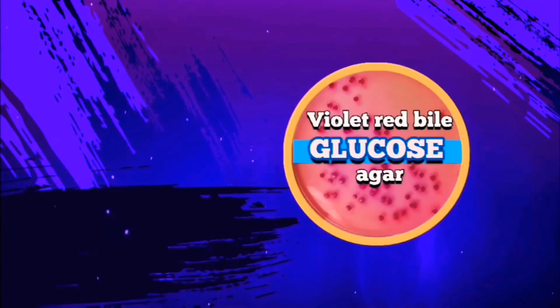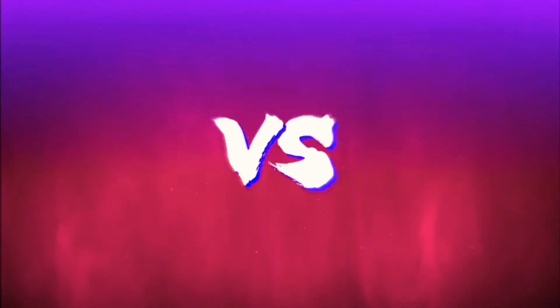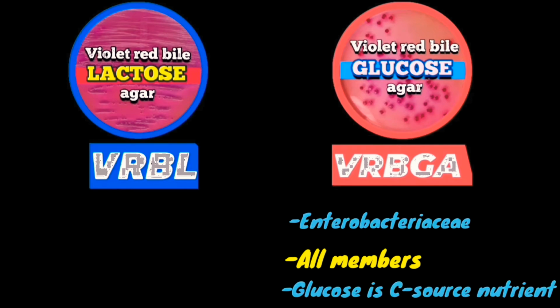Today I'm going to talk about the difference between violet red bile glucose agar and violet red bile lactose agar. Violet red bile glucose agar is used to detect the Enterobacteriaceae family, since all members of the Enterobacteriaceae family ferment glucose. The Enterobacteriaceae family contains more than 30 genera and 110 species, and all members of Enterobacteriaceae ferment glucose.